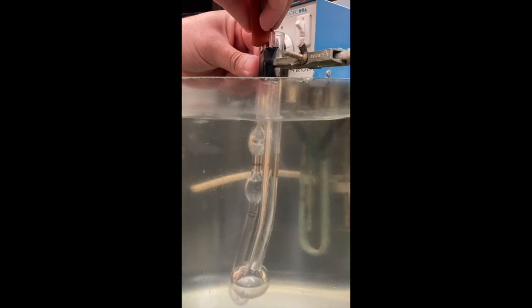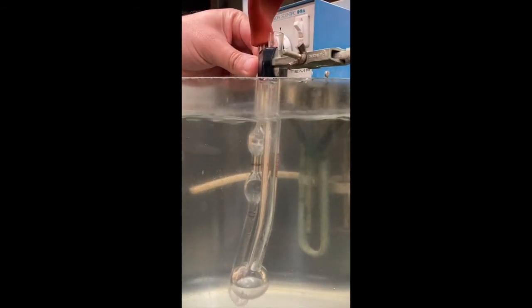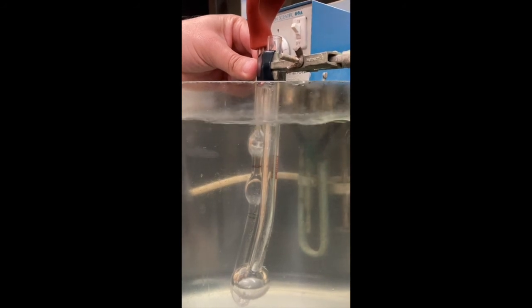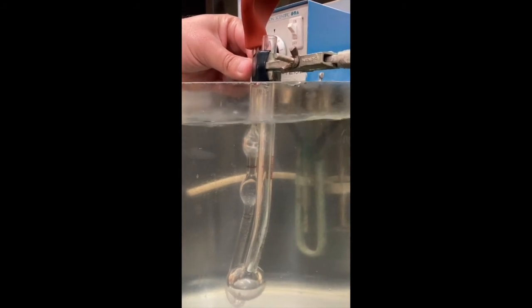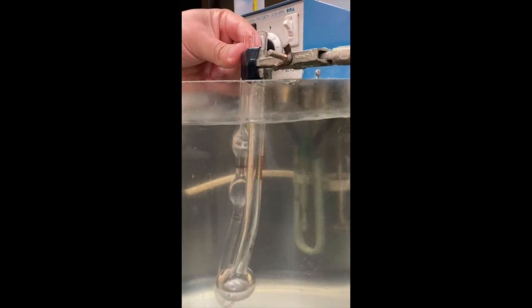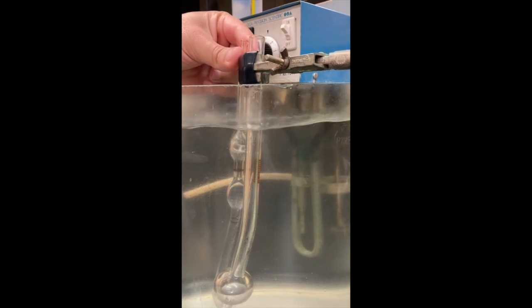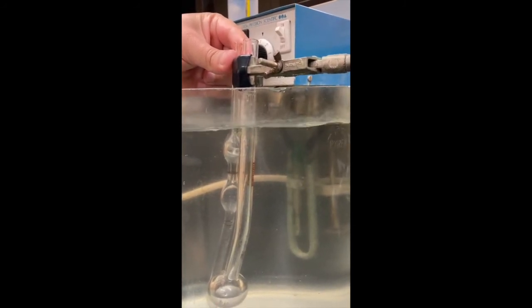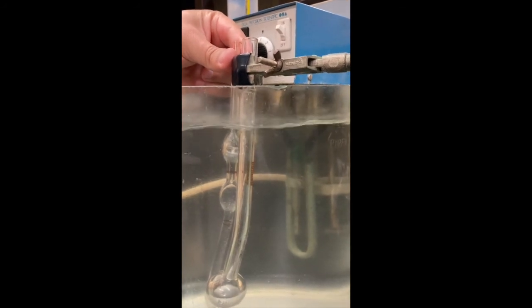You can see the level of water going up. Alright, you can release it now. And now you wait for it to start going down, when the level of water goes through the upper mark.